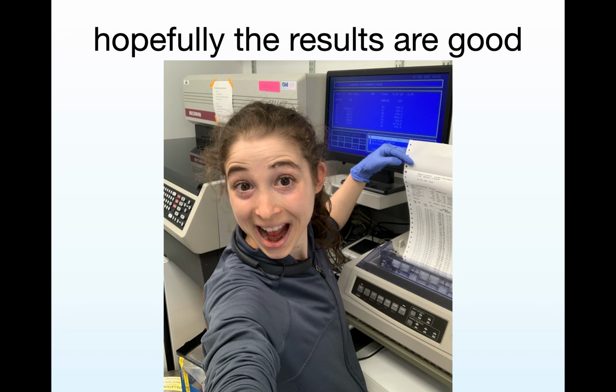So there are various reasons why this method is preferred, but it's also more tedious and time consuming, and harder to do with high throughput, if you have a ton of samples. I think I've done 100 or so at a time.